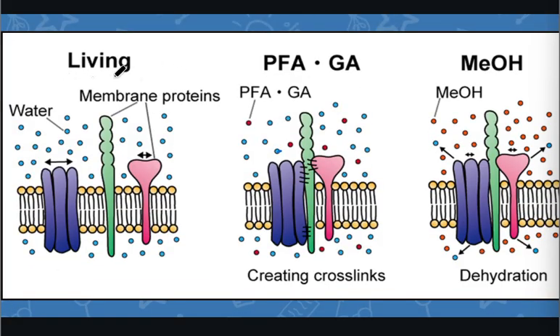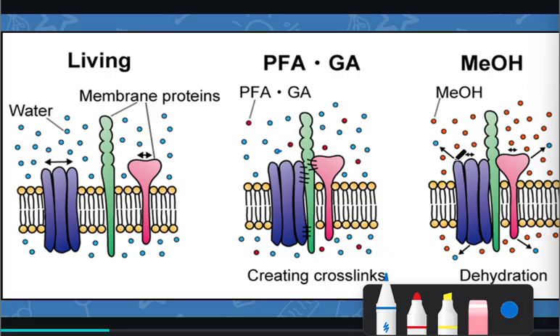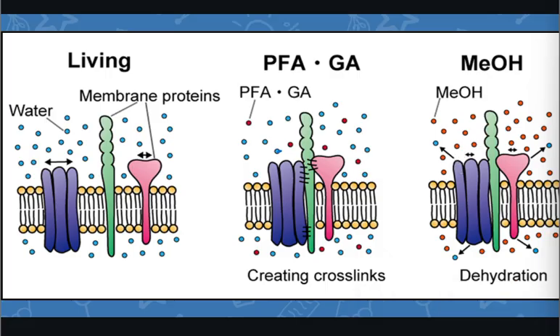So here, class, this is the living state. And this one, the PFA, the aldehyde reagents, and next, the methanol fixation. On a living state, the proteins and the membrane are surrounded by the dynamic water molecules, the color blue.